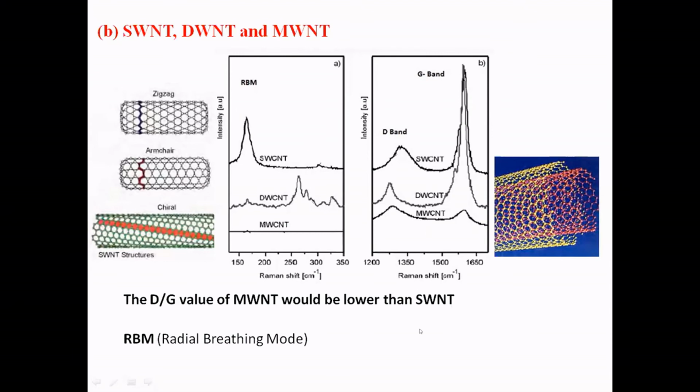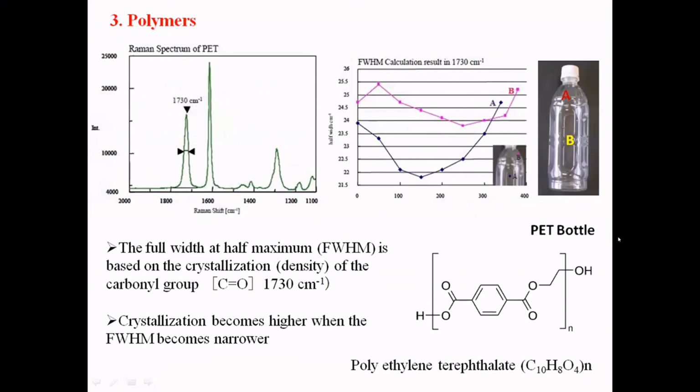And okay, fine. So these are examples, like characterizing polymeric compounds. Polymers, fine, are a very close member of Raman. So you can easily get some information about characterizing the polymeric compounds. So again, with respect to the fingerprint identification of the functional groups. Say, for example, the PET bottles are not completely made up of a single polymer. You have a combination of other polymers.